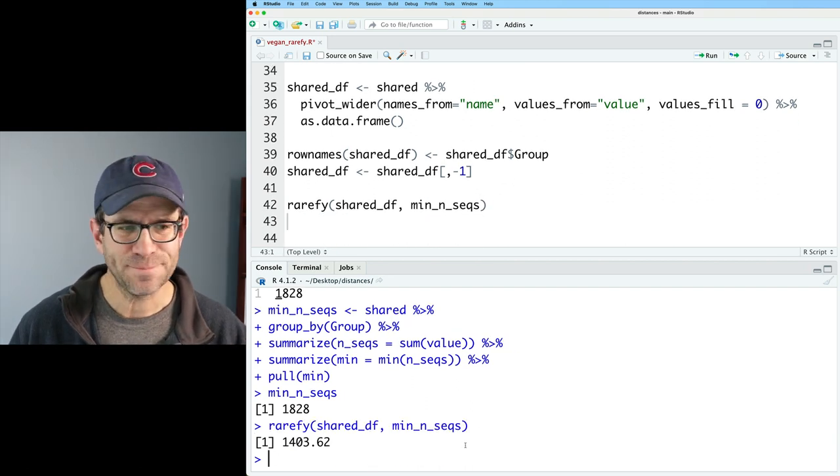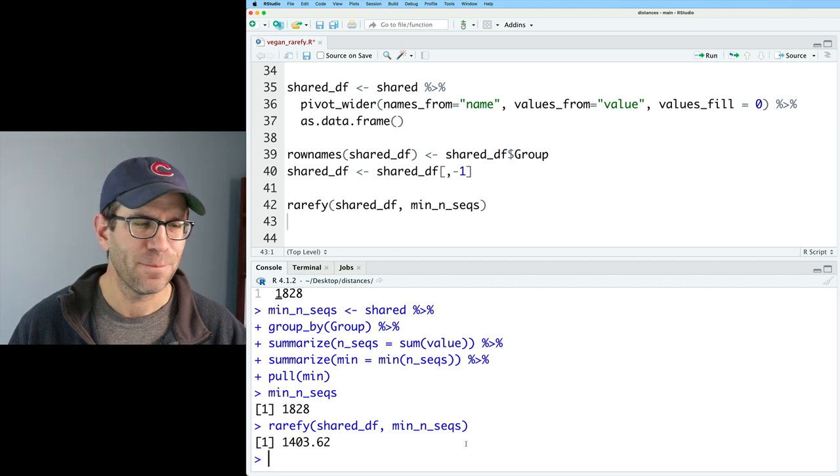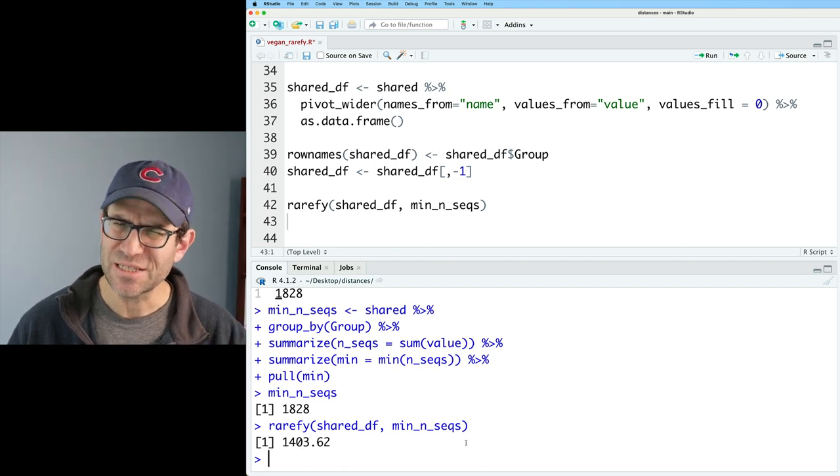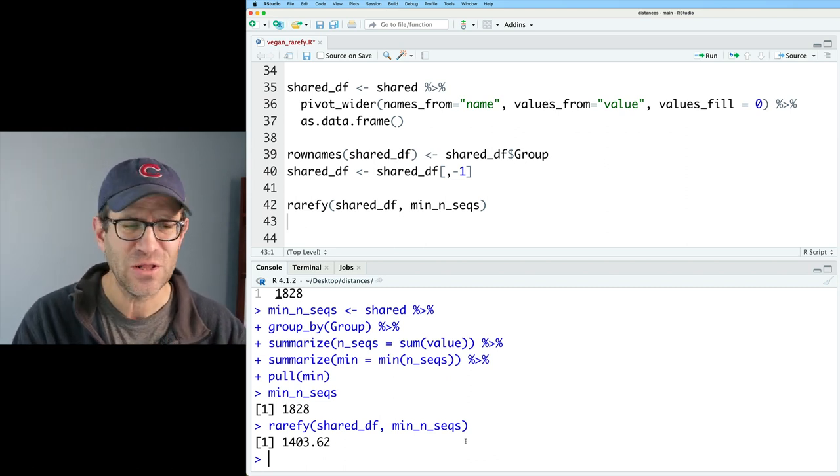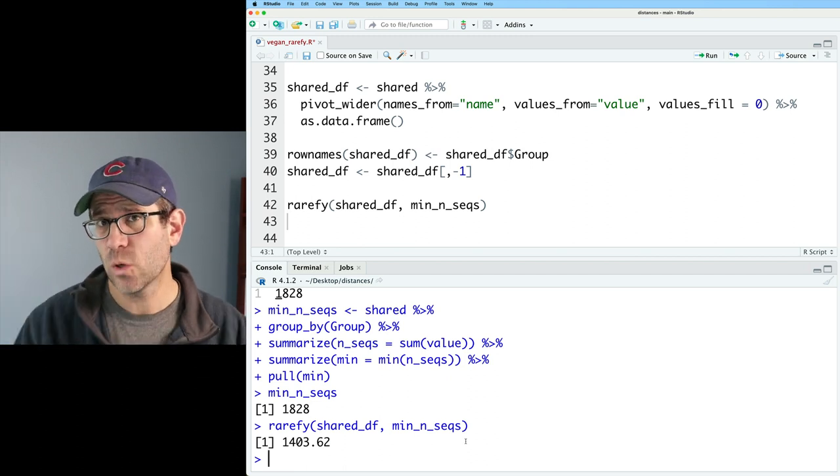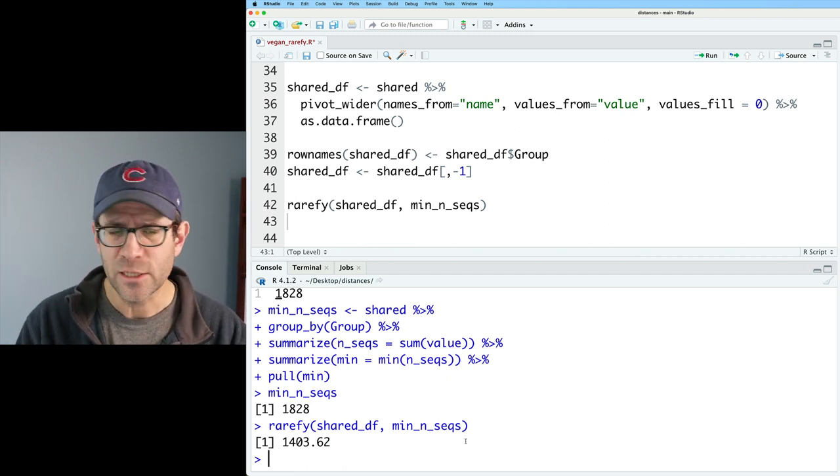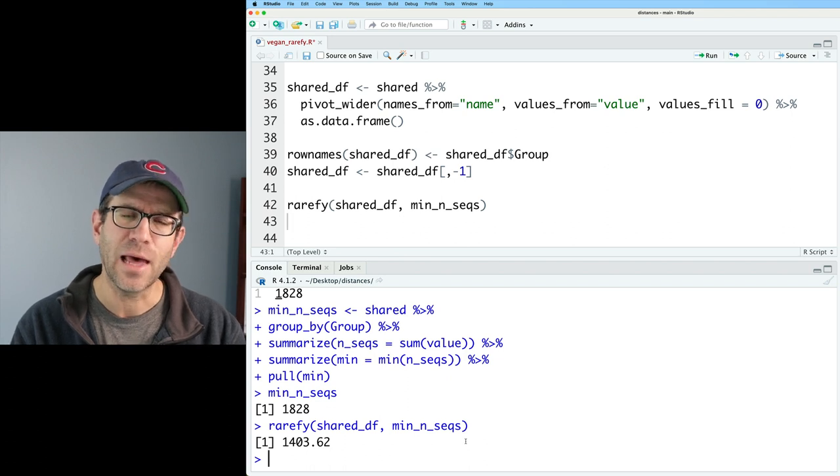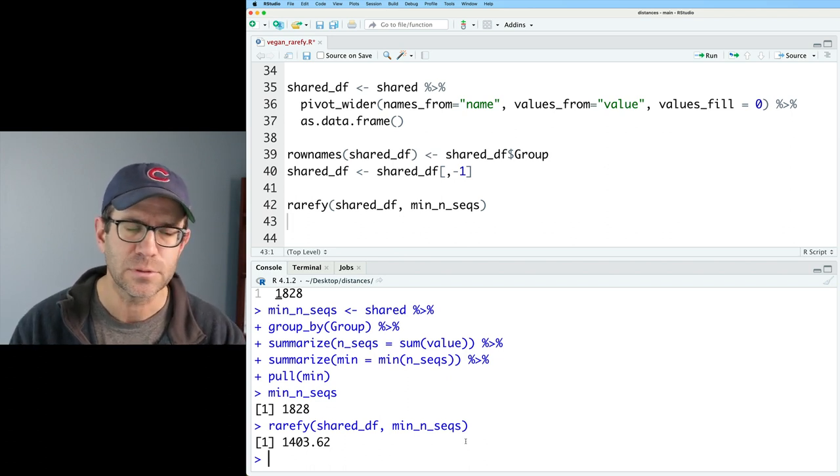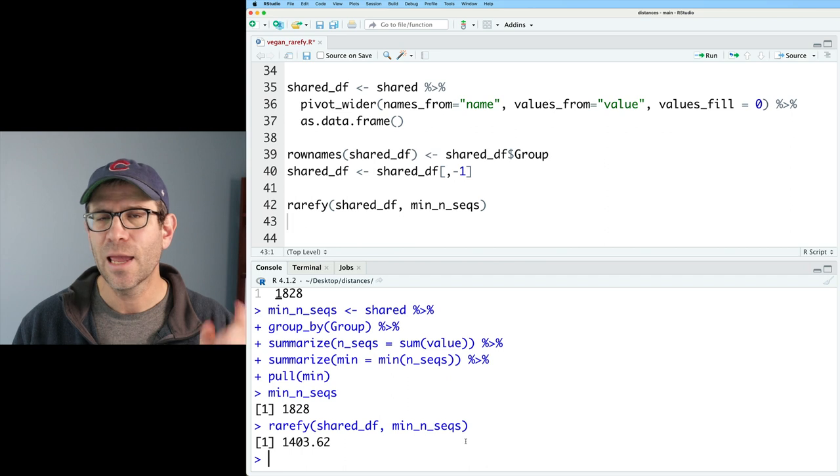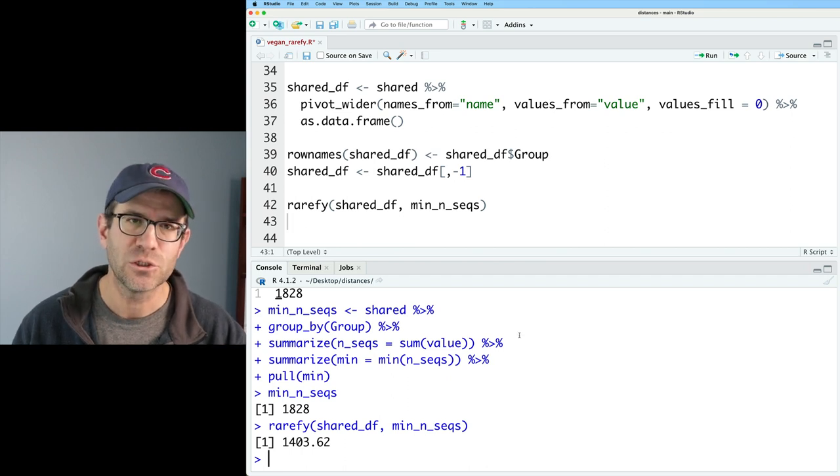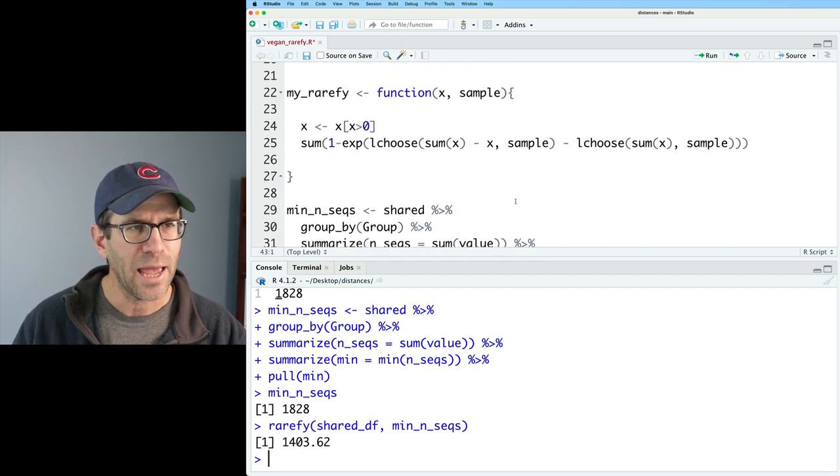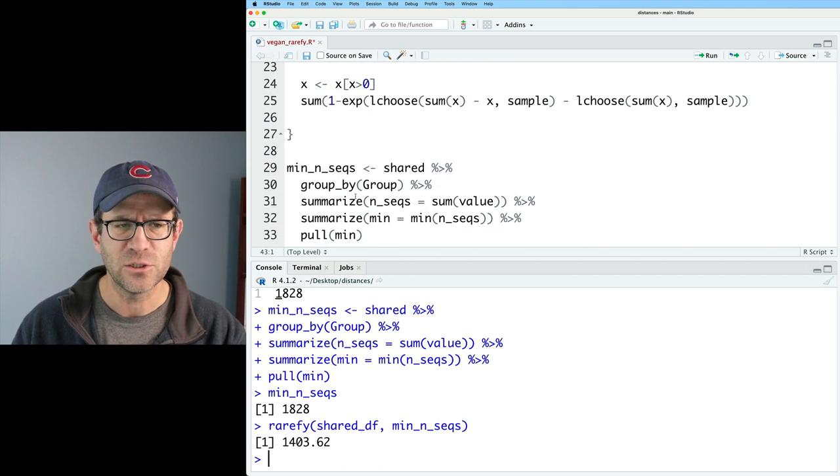So I get back 1403.62, which doesn't seem right for a number of reasons. So first of all, I'm only getting one value. I should be getting 227 values, one for each of the samples. And I think that's actually the value across all of my samples. So I think what's happening is that I'm using my version of rarefy, which I had changed to be my_rarefy, as you recall.